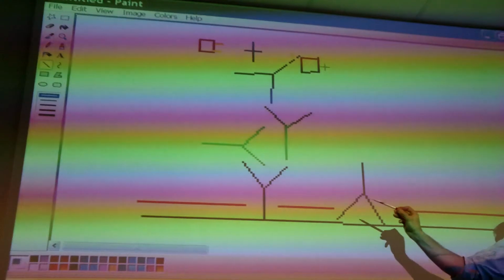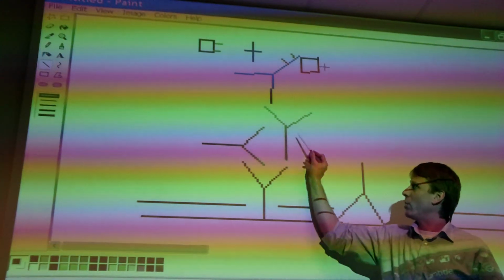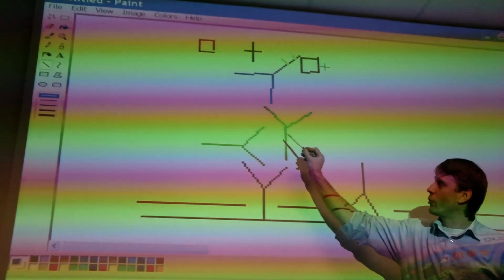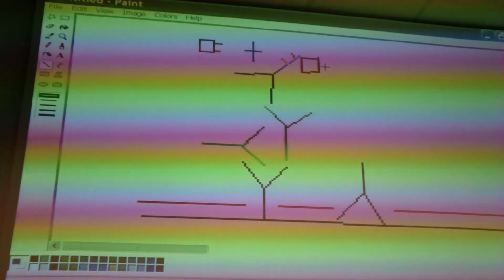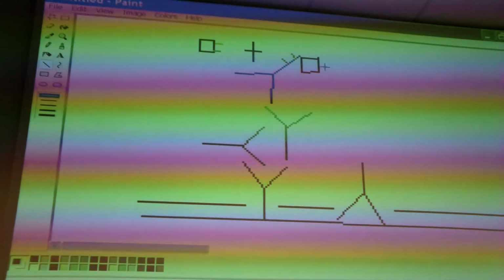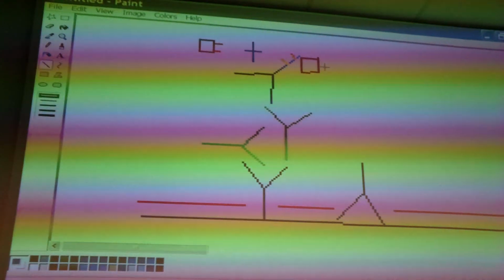And what we use here are typically polyclonal antibodies. These polyclonal antibodies have the property that they will bind different epitopes, there or there, the way I've been drawing it. So imagine this is a goat, and this is human. What species should we take for the secondary at the top? Goat, yeah. Why also goat? Because if it's also goat, it wouldn't bind its own antibody. Right, because that would be kind of an autoimmune disease, giving immune complexes. That solves most of the problem.